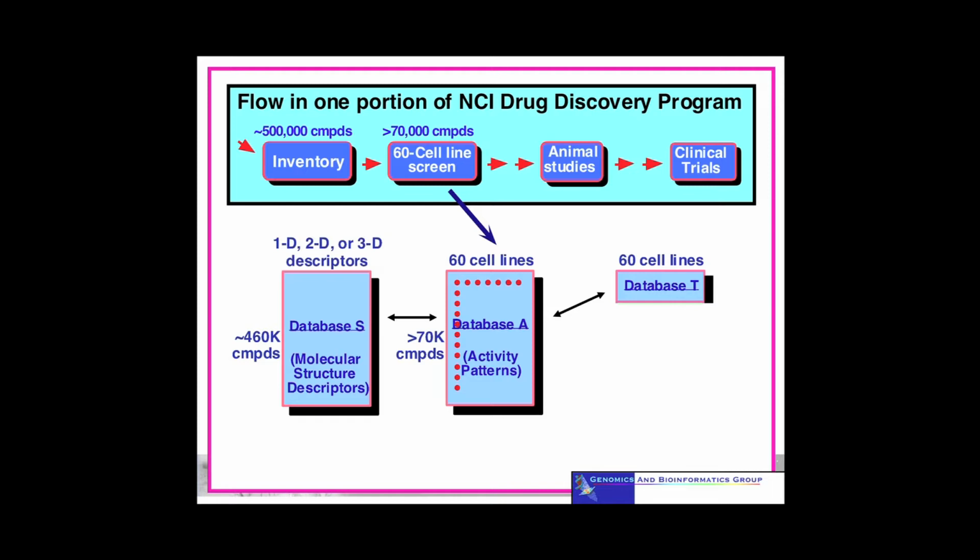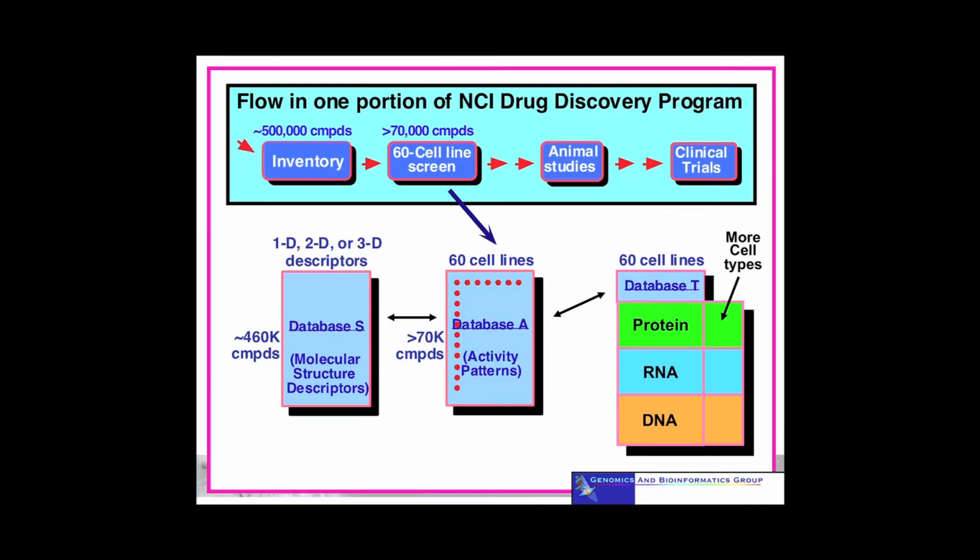And this allows you to trace a pattern of activity either across drugs if you wanted to go into molecular descriptors, or across cell lines if you want to go into biological descriptors, and look at things like protein, RNA, and DNA. And you can access this information if you have these similar measurements in whatever new sample, which includes TCGA.